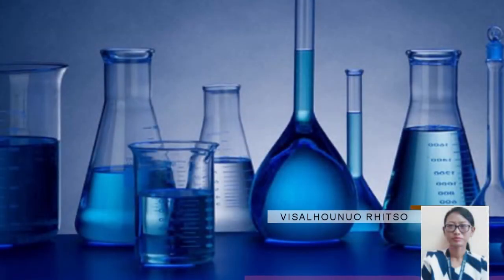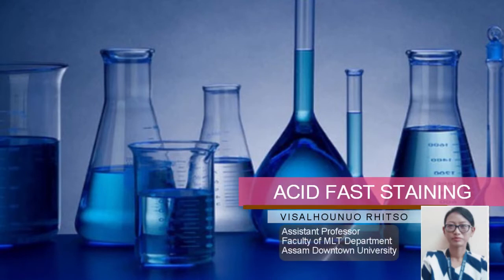In this video, I'll be explaining acid-fast staining. It is a method to stain acid-fast bacteria like Mycobacterium, slender rod bacilli. They do not stain readily, but once stained, resist decolorization due to the presence of lipid-rich, waxy materials, that is, mycolic acid on the cell wall. So they are called acid-fast bacilli.